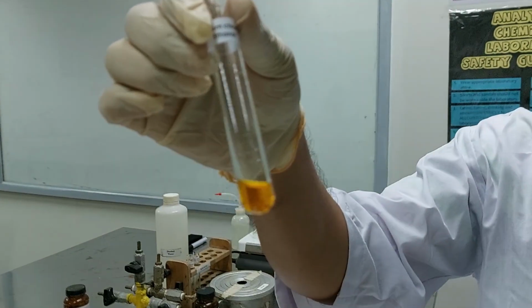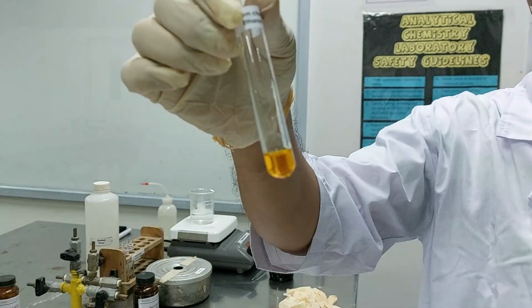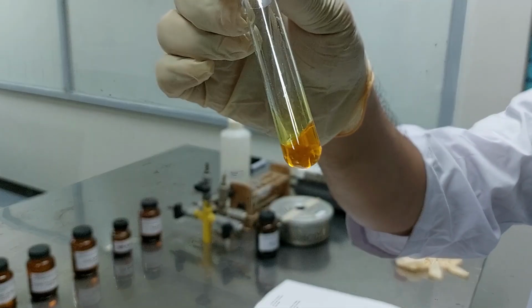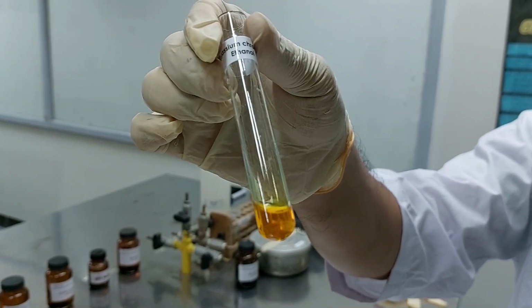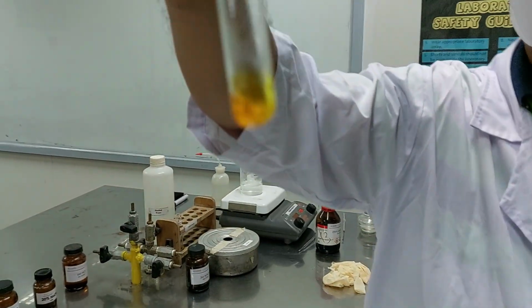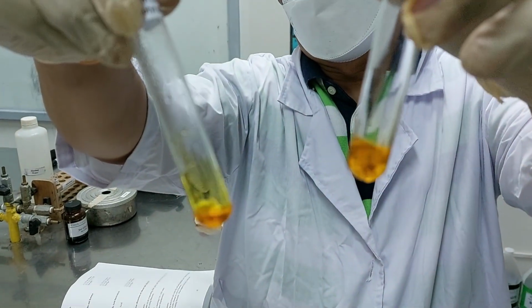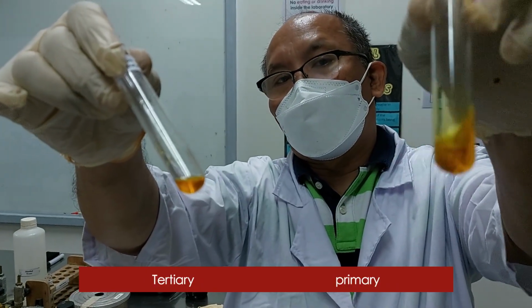Okay, so this is the primary alcohol, ethanol class. Observe the green color when I shake this one. Okay, shake. So you see the green color, light green color. That is for primary. Compare that to tertiary. This is tertiary. Look at that. This is tertiary alcohol, and this is primary alcohol.